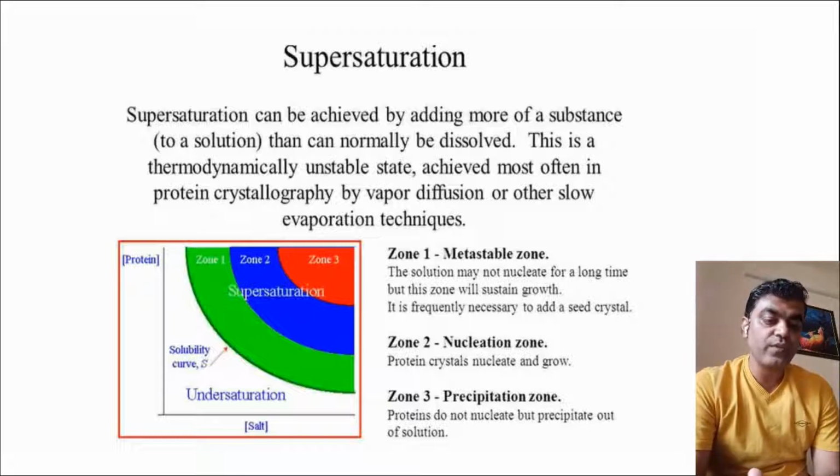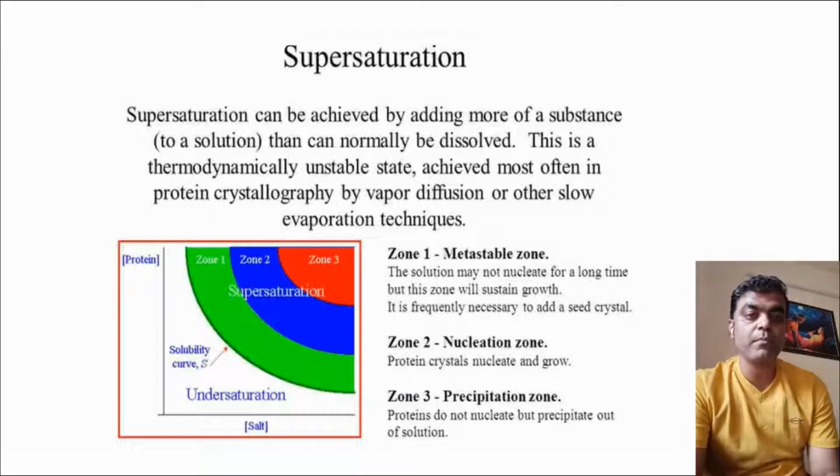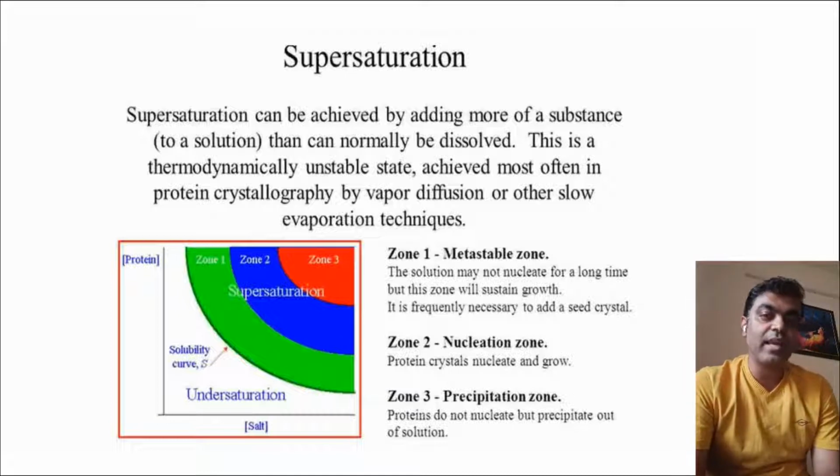Means if in 1 ml solvent, usually 1 milligram of the substance can be added, and I add more than that, that condition is a supersaturation stage.